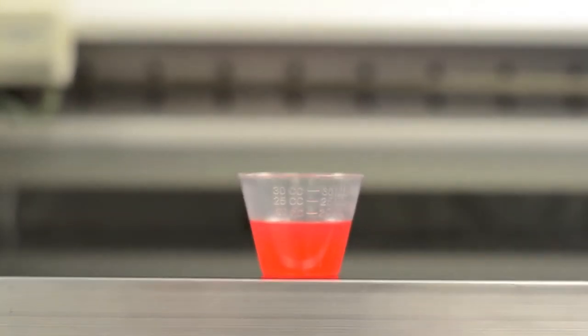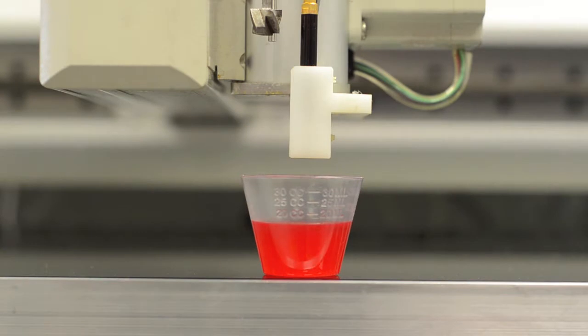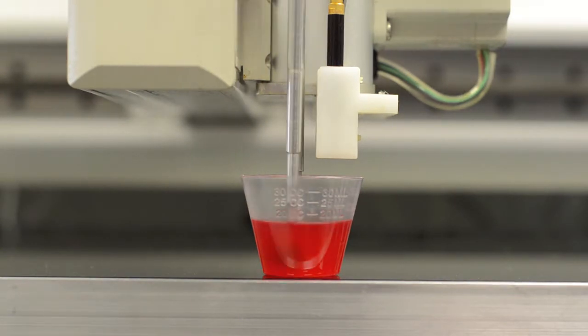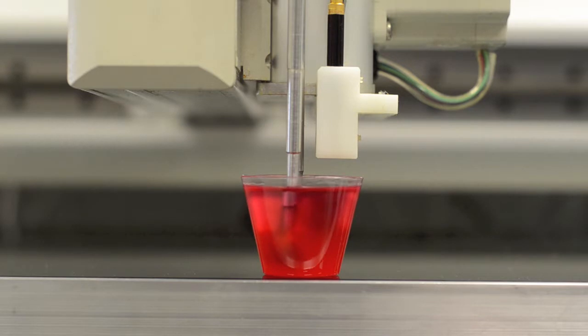The Synergy CSEPC2 produces highly accurate results even with the most heavily contaminated oil samples. The system is designed to automatically dilute each oil sample being tested, and the diluent employed is effective for removing up to 2% emulsified water from oil.